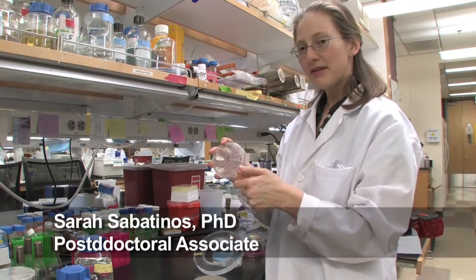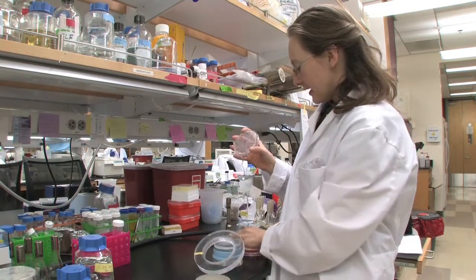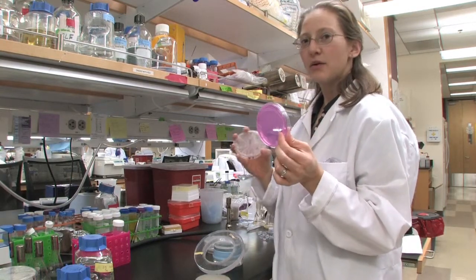So I'm going to take this plate of yeast and make a copy onto different kinds of plates. One is a drug plate, and another is a plate that has a chemical that helps us look for fitness, so if the cells are sick or if they're healthy.